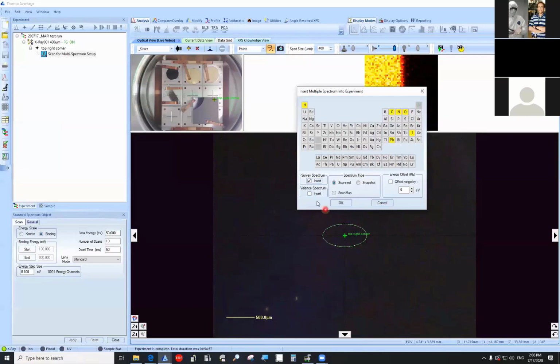Okay. But it would also be nice to check for tin and lead because that's in the substrate. Tin and lead, very good. Yeah. Or sorry, I mean, was it indium and tin? Indium and tin. Yeah, indium and tin.